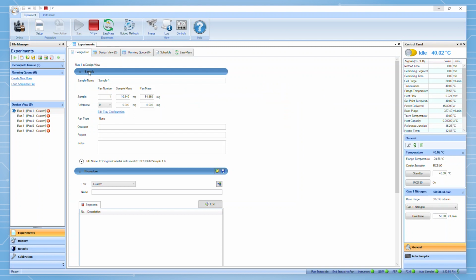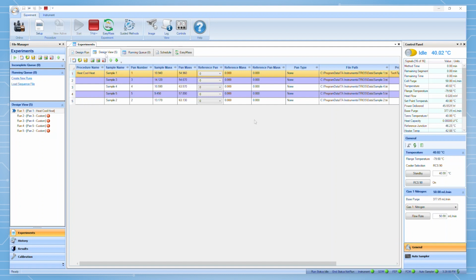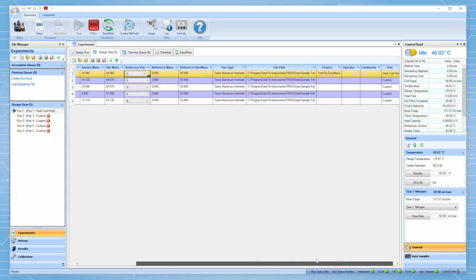The Design Run tab is the default view you are probably used to in TRIOS, while the Design View tab shows all runs in table form. One tip for this table is that you can right-click a cell and select Fill Down Selected Data to quickly fill in experiment parameters for all tests. For example, if you want to use the same reference pan for each run or the same test procedure.